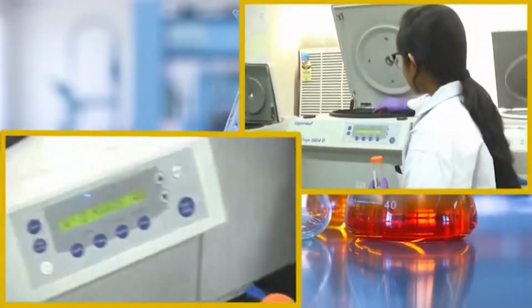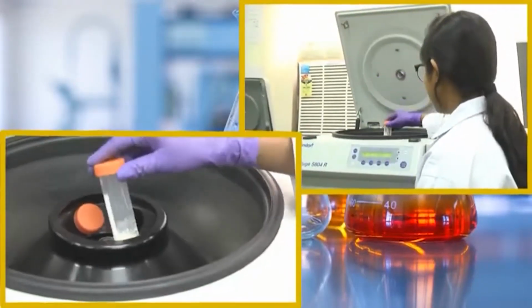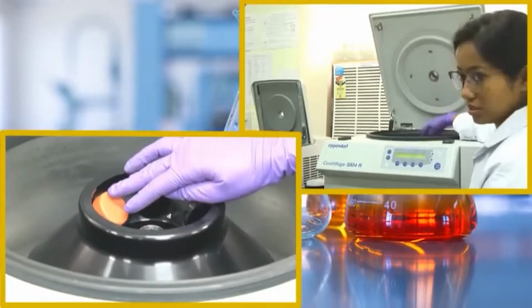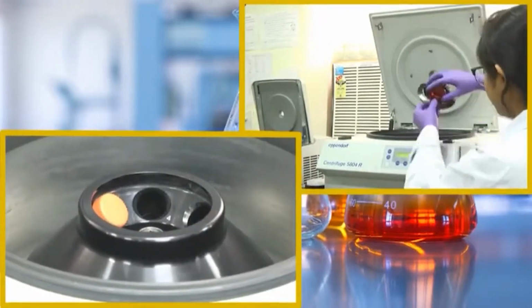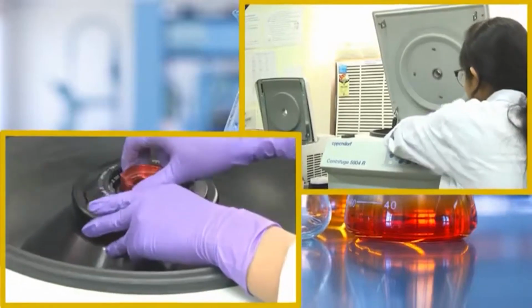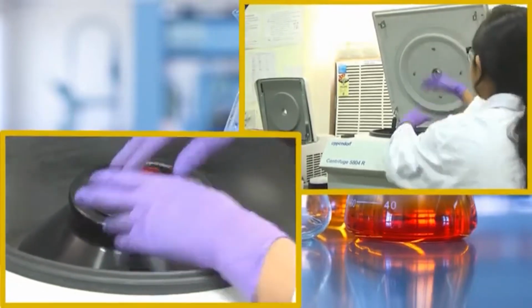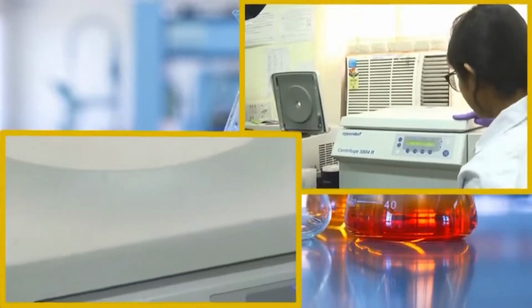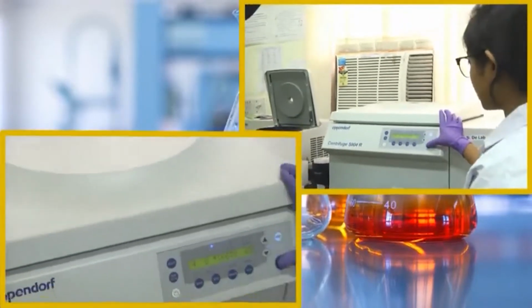So, put the sample and the weight balance at the opposite side. It should be exactly opposite. Close the rotor head and we will start the centrifugation.